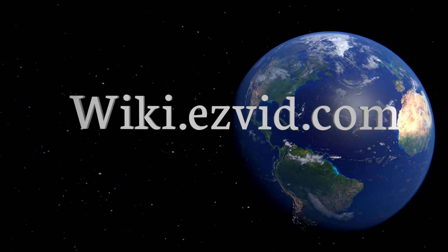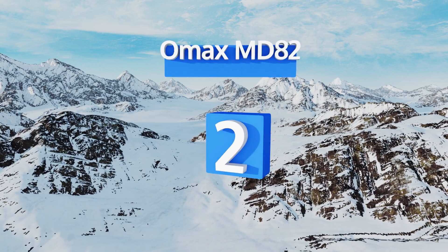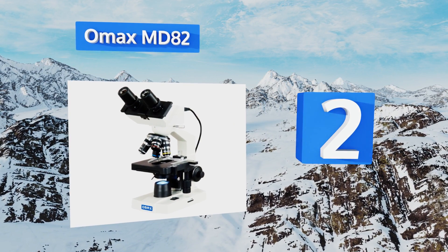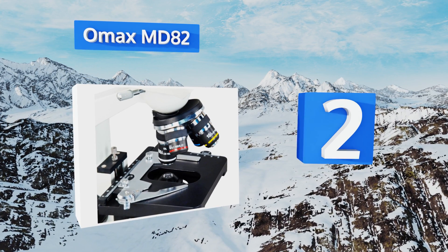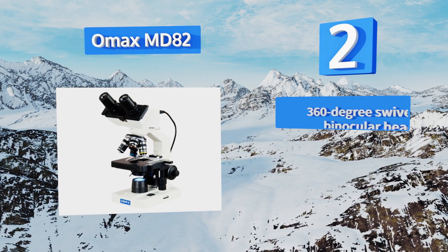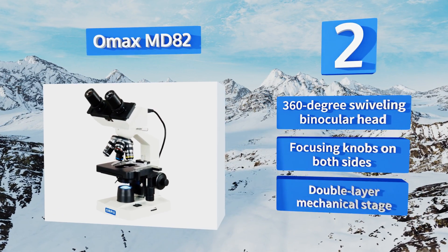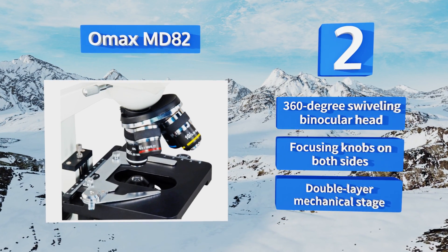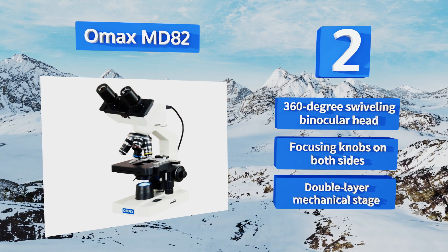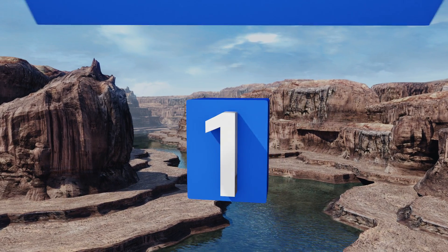At number two, the powerful OMAX MD82 is a biological compound option that offers eight levels of magnification ranging from 40 times to 2000 times, as well as variable illumination intensity. The included software is Mac and Windows compatible, with an advanced package available for PCs. It includes a 360-degree swiveling binocular head, focusing knobs on both sides, and a double-layer mechanical stage.